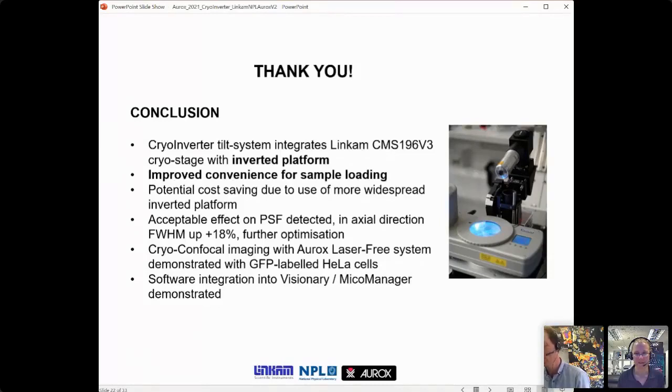So the objective lens, if you tilt it out, yes, the tip may have condensation, and you may need to dry the lens in some cases. It depends for how long you tilt it out.